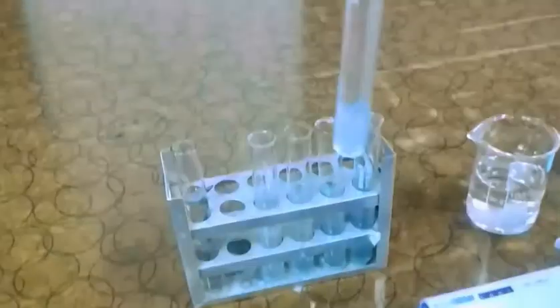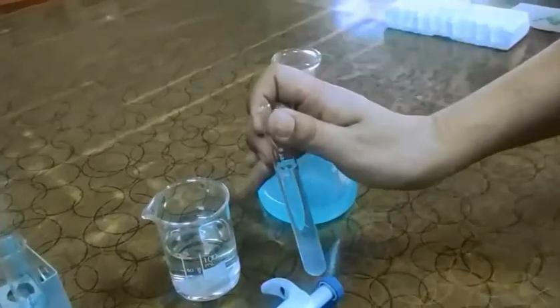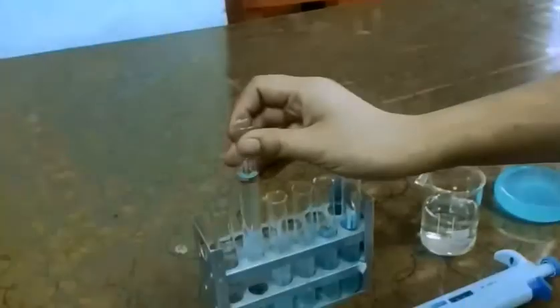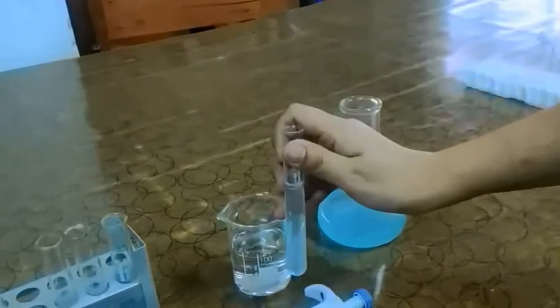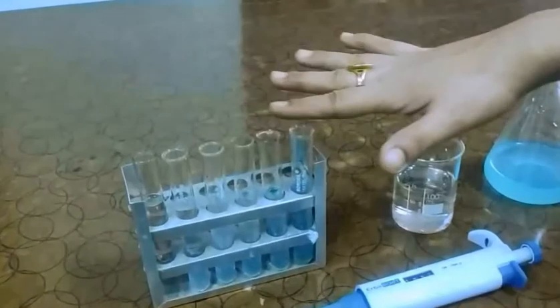And this is the first test tube that I'm going to test. In this I have mixed 1 ml of copper sulfate with 9 ml of distilled water. And then this is the second test tube, in this 2 ml of copper sulfate with 8 ml of distilled water.